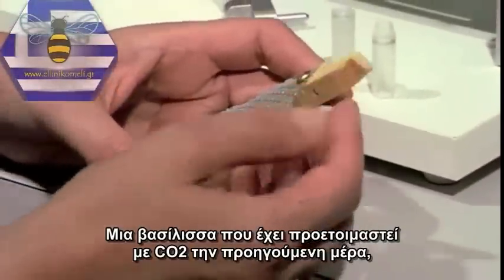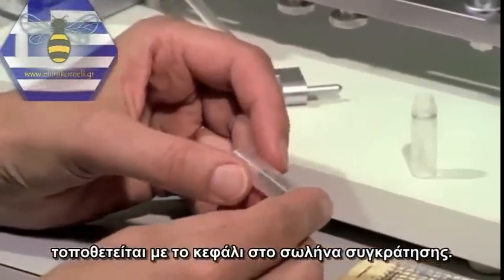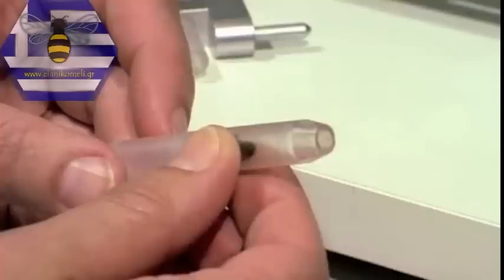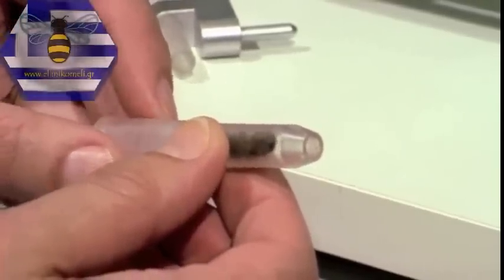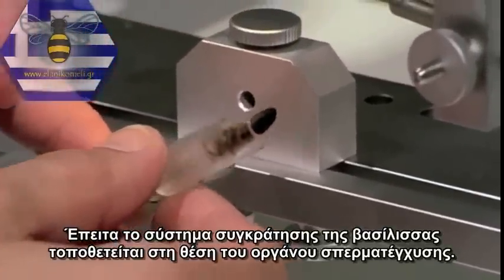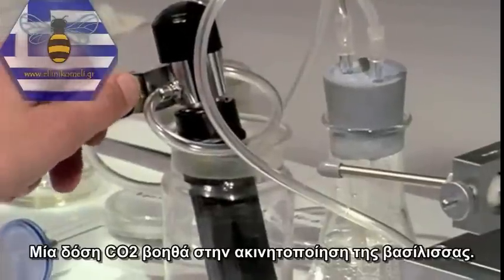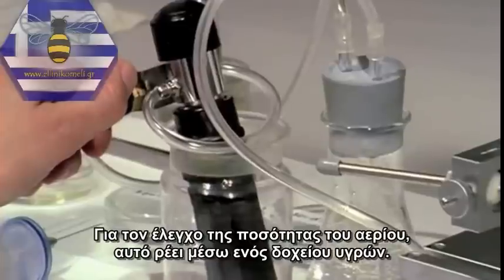A queen who was treated with CO2 on the previous day is placed headfirst into the retaining tube. Then the queen holder is fixed to the block on the instrument. A whiff of CO2 helps to immobilise the queen. To control the dose of gas, it flows through a washing flask.